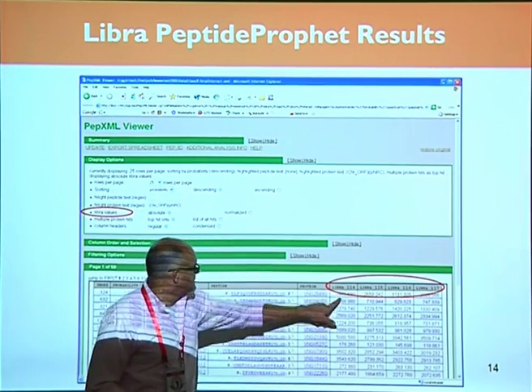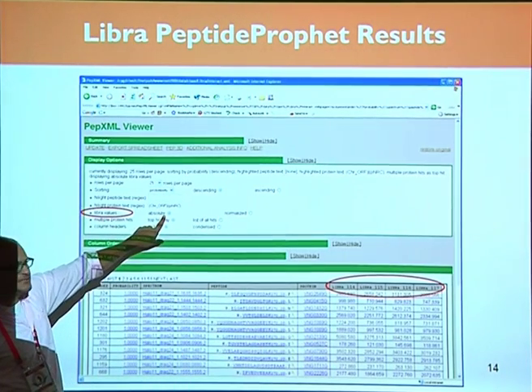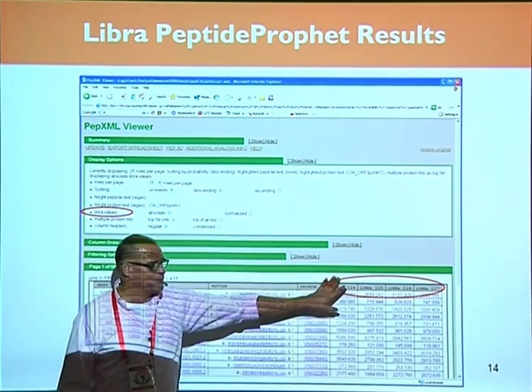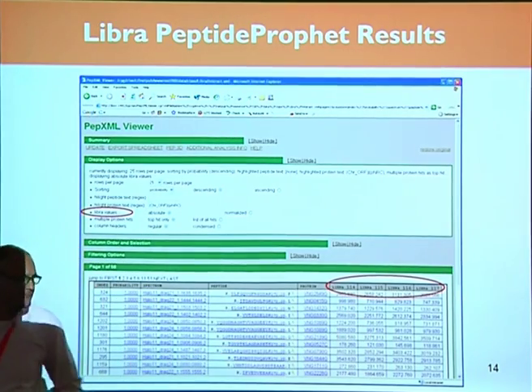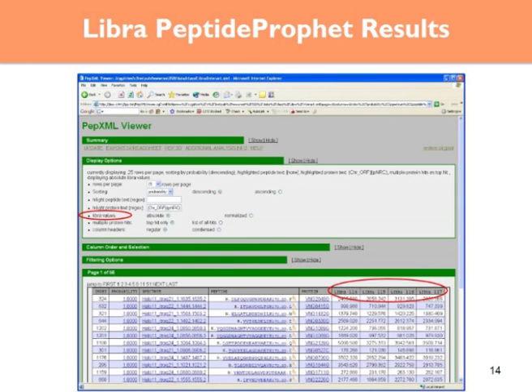You can either view the raw values, the absolute intensities, or normalized. When you choose normalized, whichever channel you pick to be your reference will be 1, and then all the other values will be scaled to that, which is a much easier way to compare things than these big numbers.